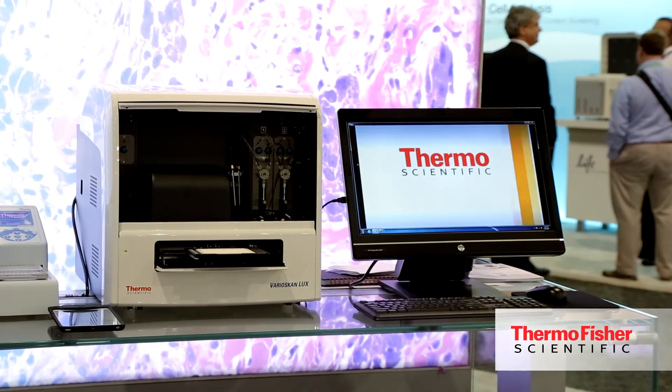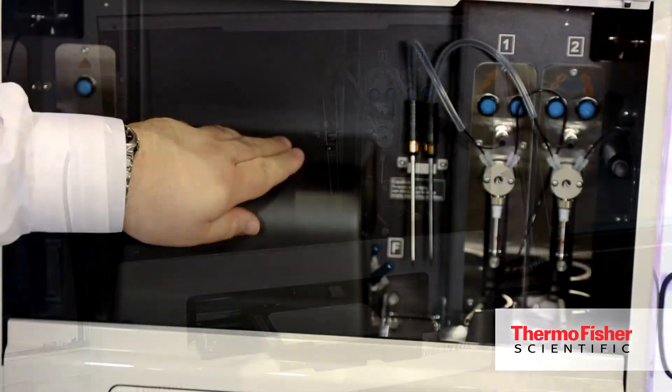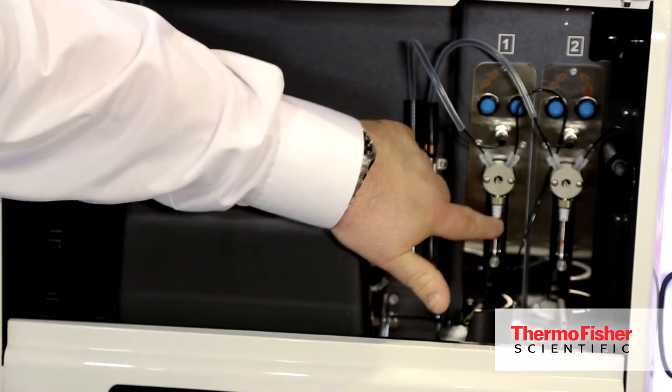We've really made it smart — the instrument has automatic dynamic range selection and has a lot of different internal checks that it makes to ensure the instrument is going to perform the assay properly. That saves the customer time, money, reagents, and samples.